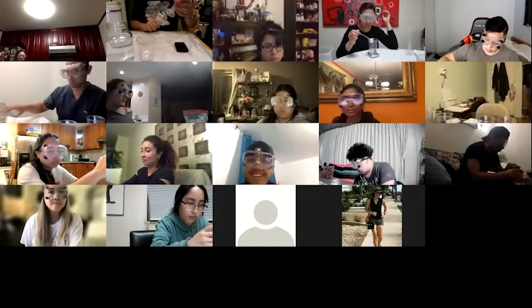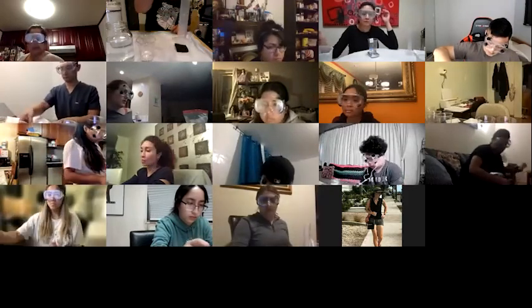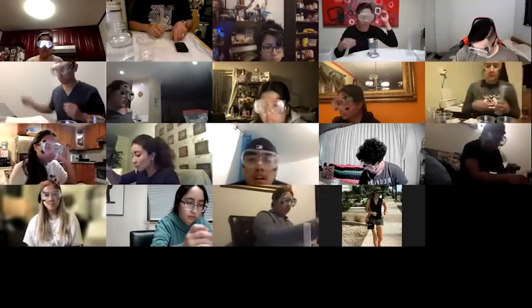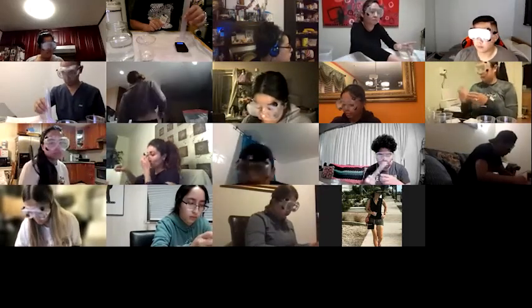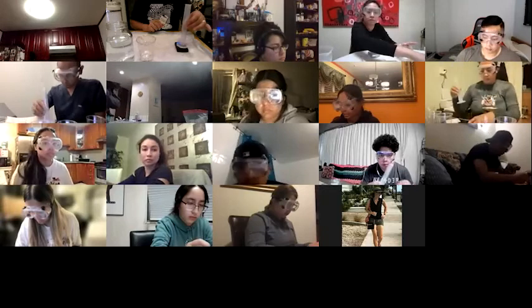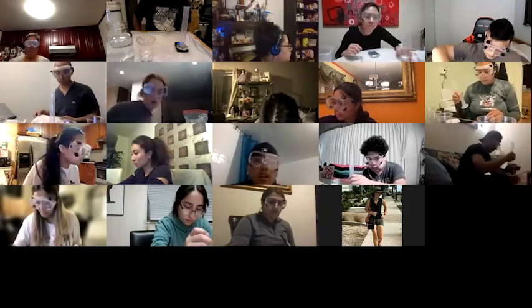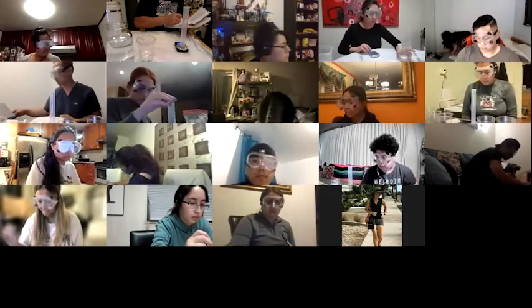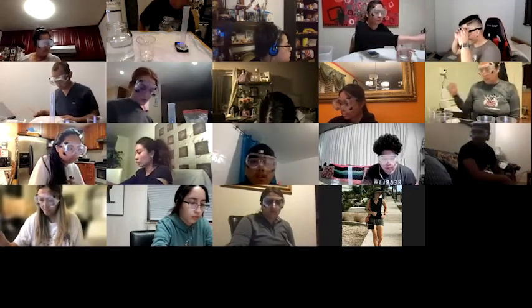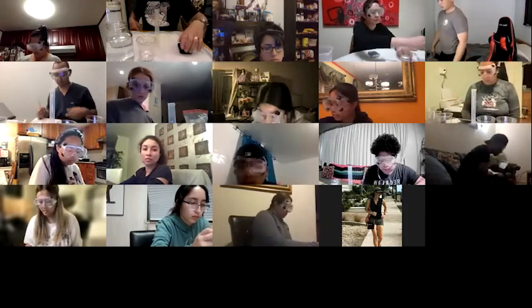Okay. So I get rid of the liquid that's in here. And now is where we measure the mass of the cylinder. So I tare my balance. I put my empty 50 mL graduated cylinder on it, and I measure the mass, 29.45. Okay. Then I take it off.